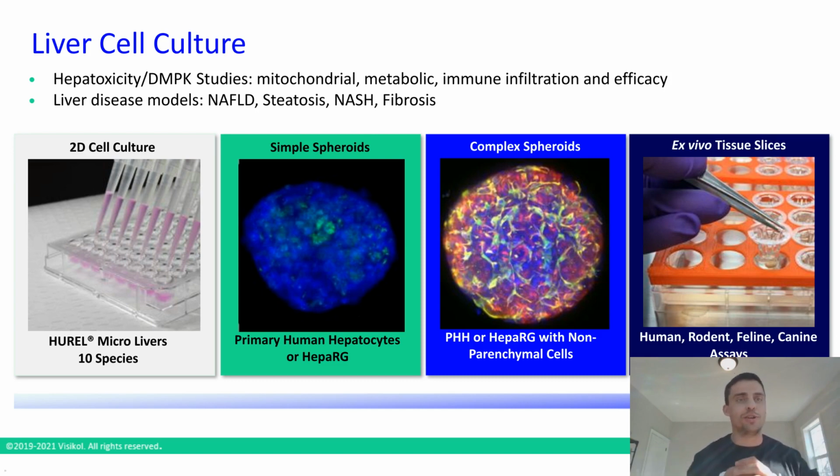So we're taking one tissue and turning it into lots of different experiments through the ex vivo platform, which I'll talk more on later. But again, these models are going from less complex to more complex on the far right. The trade-offs are throughput and cost, which I'll touch more upon later. So not every model is great for every research question. I'm going to dive into a few of these examples in more detail and also touch upon which one might be right for your specific research question.